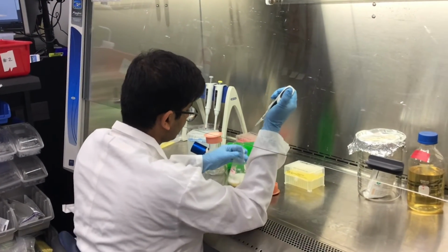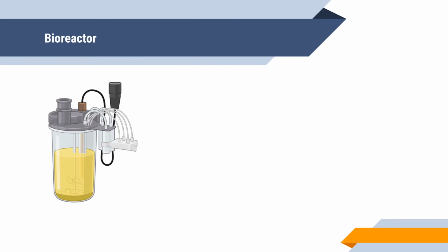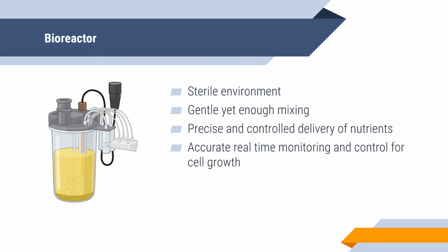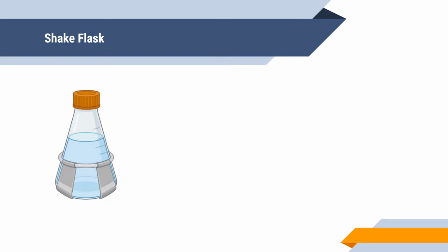Cell culture is one of the major tools used in cellular and molecular biology. Bioreactors are known as one of the ideal methods to culture cells. Bioreactors provide a sterile environment, gentle yet thorough mixing, a precise and controlled delivery of nutrients, and accurate real-time monitoring and control for cell growth. However, bioreactors are expensive to purchase and operate and prone to malfunction.